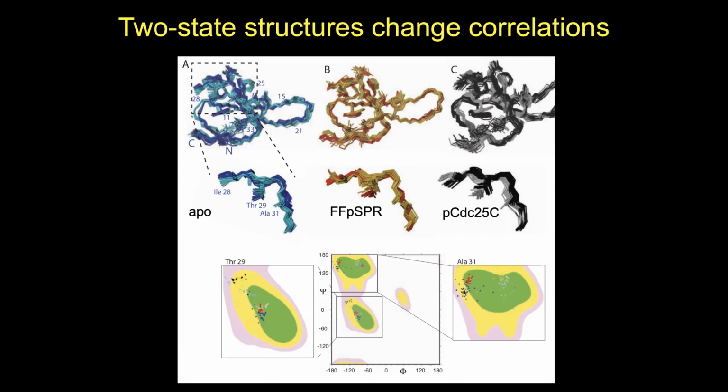Now comes the very interesting finding. What happens with the negative ligand? Of course, you can do these plots again. You take the N-terminal here, you plot dihedral angles, and again, you see the black state here and the gray state here. So they're separated. That's not surprising. But now what happens if you look at the other side, or the C-terminal part of this loop?